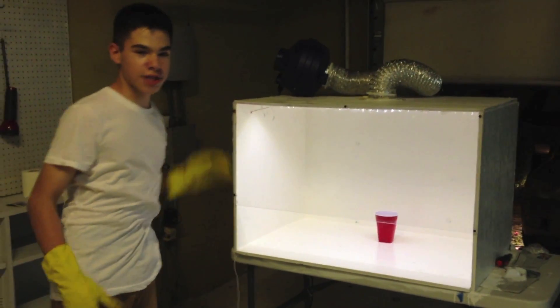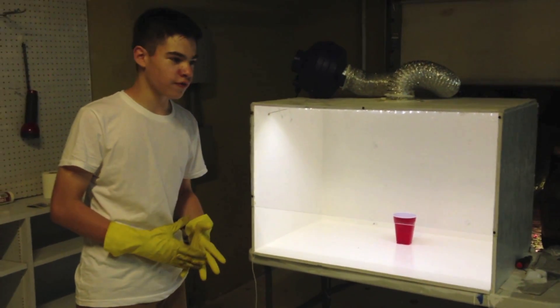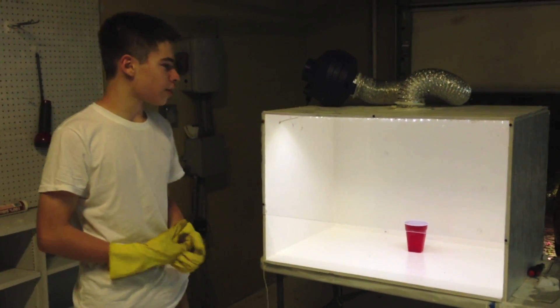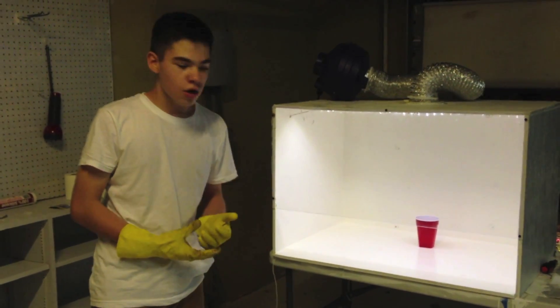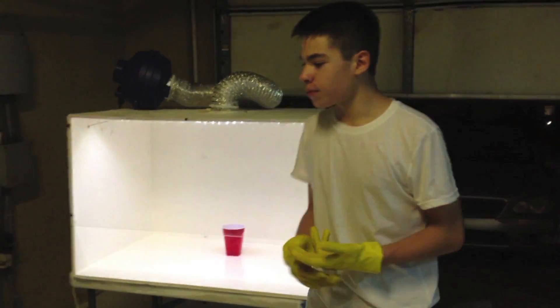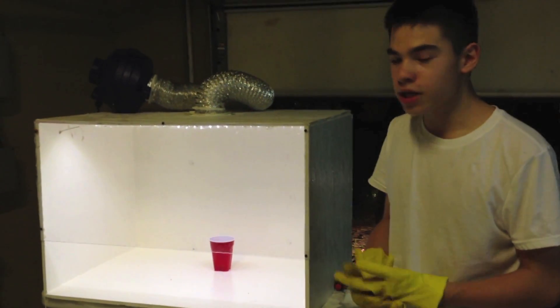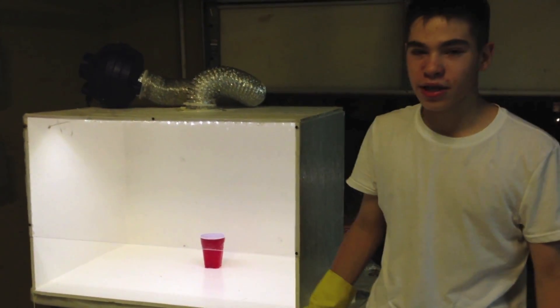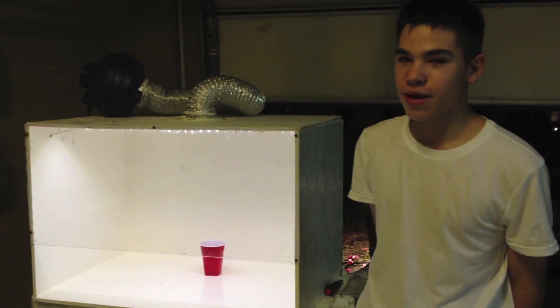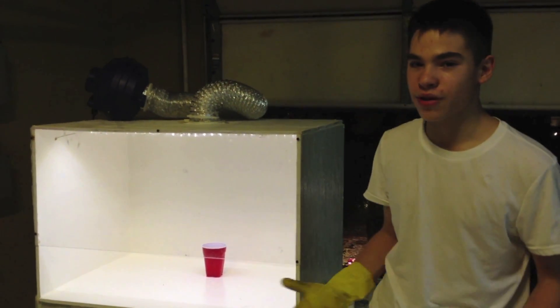Right here is a centrifugal fan from Home Depot with a CFM of about 250, so it's moving air at about 250 cubic feet per minute. The velocity of a fume hood is measured in FPM, which is feet per minute. When I ran the numbers, I found that this hood is 90 FPM, and the recommended range for fume hoods is about 80 to 120 FPM, so we're within that range.